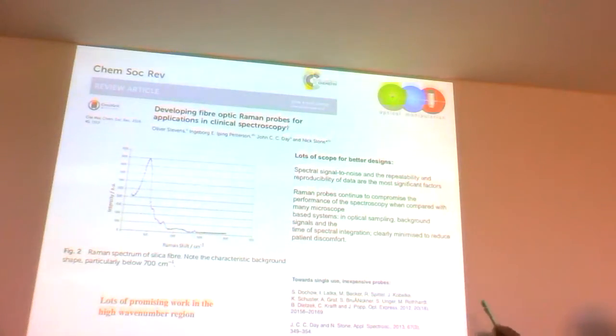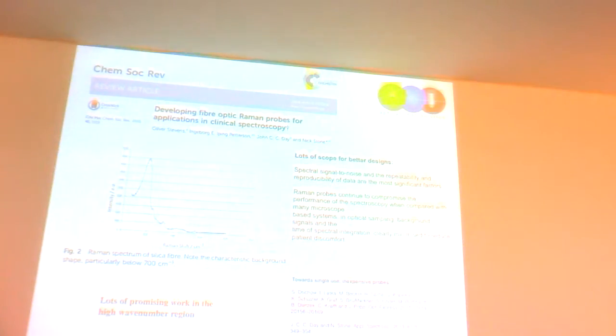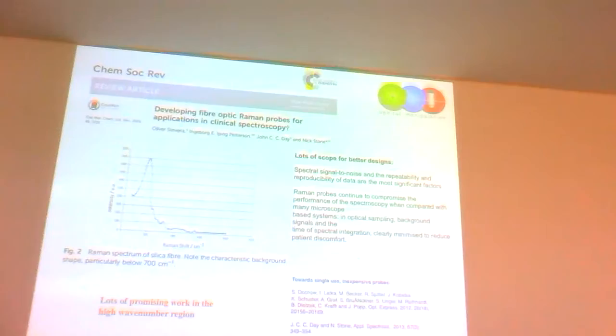If you're interested, this is a very recent review paper by Nick Stone's group. Nick Stone is now at Exeter, has worked very nicely with Gloucester NHS Trust. I'd recommend this paper. It's very nice. It gives a very good overview of what's happening in the field. And it also talks about some of the applications where you use exactly what I've shown, but rather than using free space optics, we might go to fiber optics.